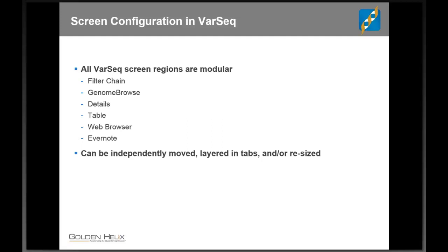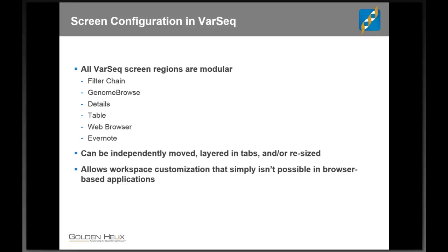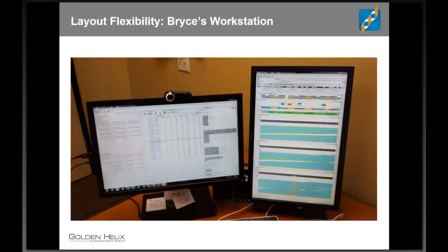But I just want to emphasize that this allows workspace customization that simply isn't possible in browser-based applications, especially when you have multiple monitors available. It allows analysts to set up their screens to see the information that is most important to them. Just as an example of that, this is a picture of my own desktop. It's the exact computer that I'm sitting in front of as I deliver this presentation today.